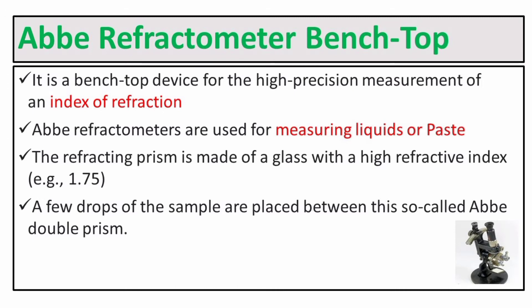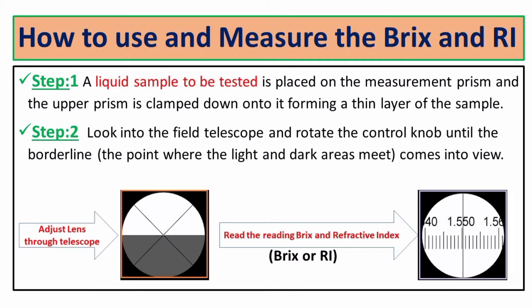Now, how to use and measure the brix and refractive index. Step one: the liquid sample to be tested is placed on the measurement prism, and the upper prism is clamped down on it, forming a thin layer of sample. We have to put the sample between the two prisms.